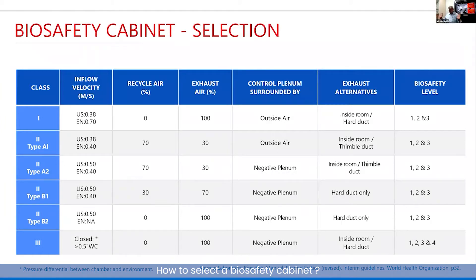In the case of Class 1, the air which is coming in is unfiltered and it is exhausted back into the surrounding within the laboratory. It does not offer any protection to the product, and while it can be used in biosafety levels 1, 2, and 3 based on risk assessment, it is generally obsolete nowadays.